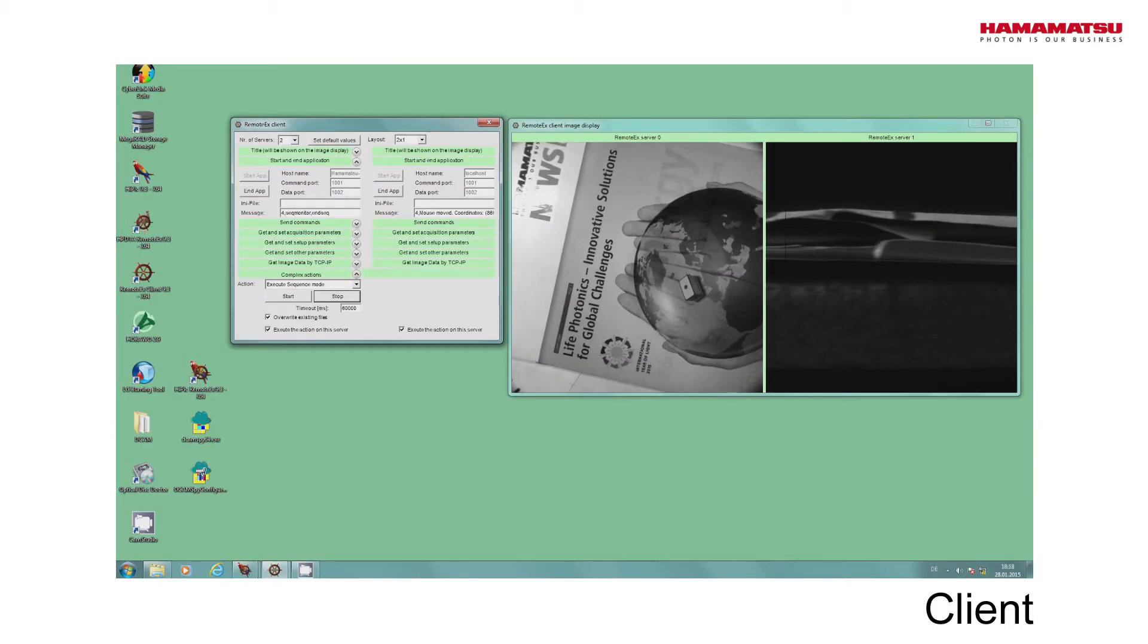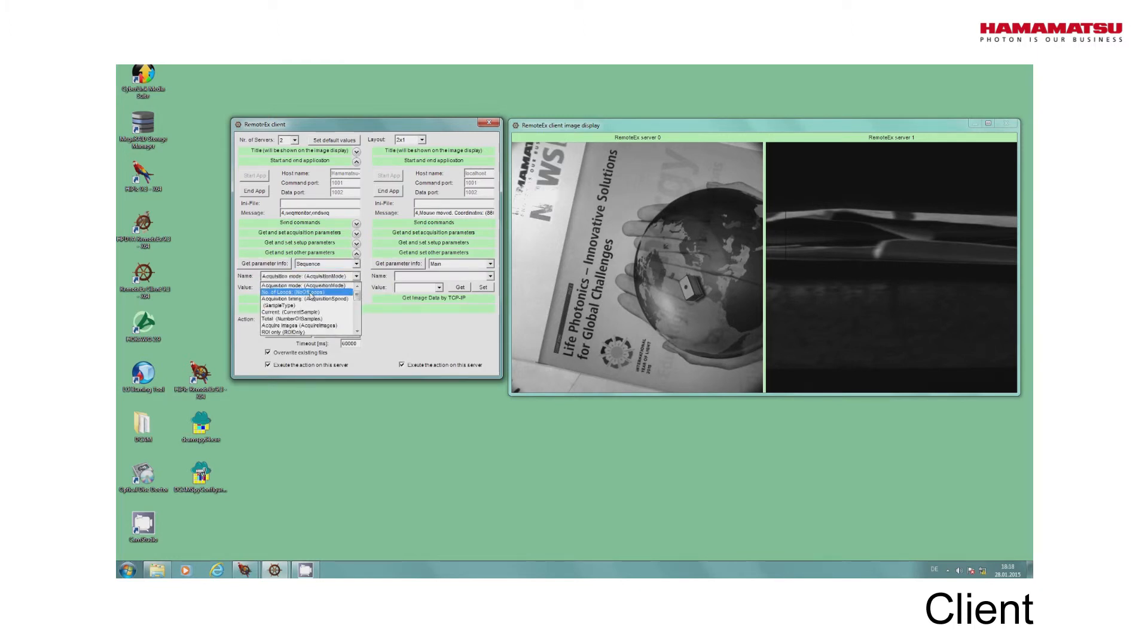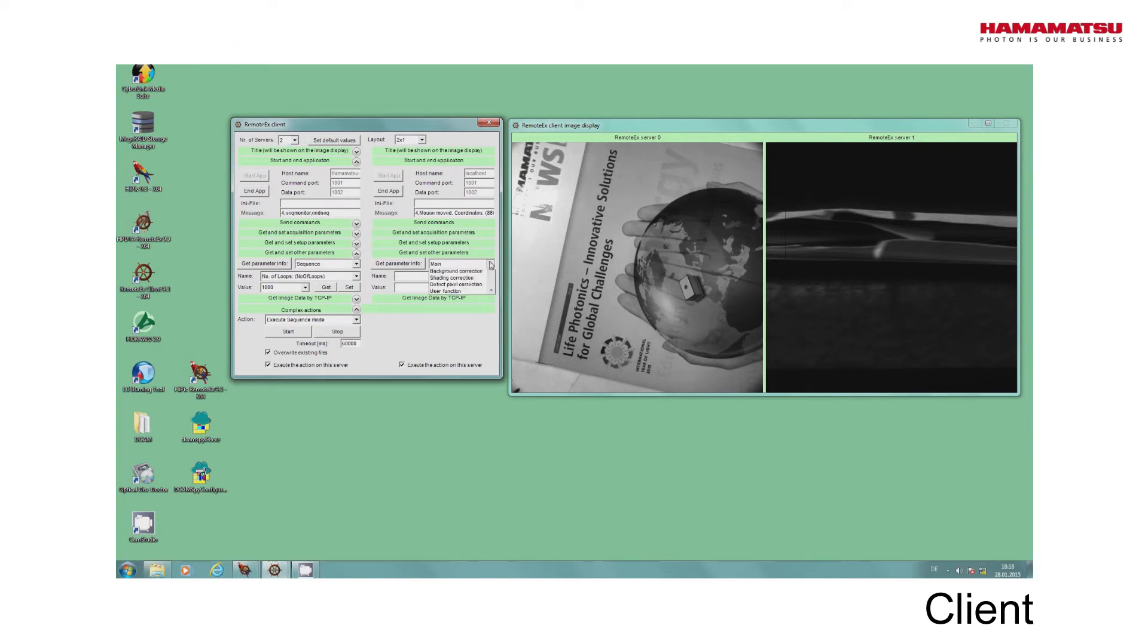To define the details of the sequence acquisition, we can select a parameter from a list and select a new value. To show this, we select a parameter Number of Loops and set it to 1000 on every server.